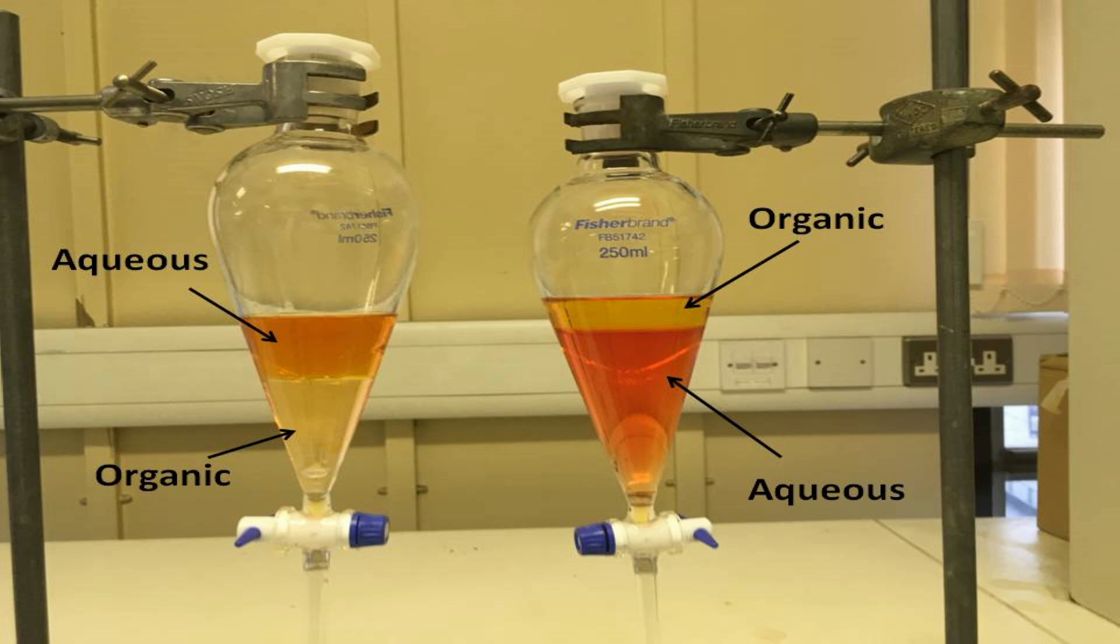But on the left-hand separating funnel, the orange aqueous phase forms the top layer, and the bottom layer is the yellow organic phase. This is because an organic solvent called dichloromethane, DCM, was added to water, and DCM has a density of 1.3 grams per centimetre cubed. Hence DCM is more dense than water, so the bottom layer on the left-hand separating funnel is the organic phase.